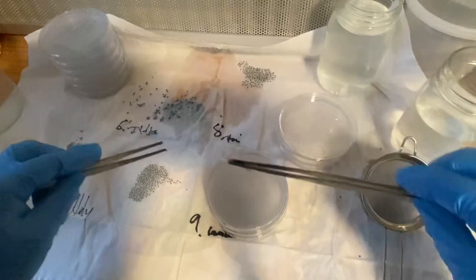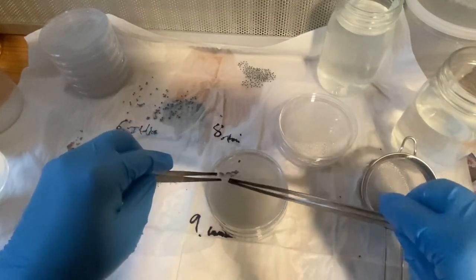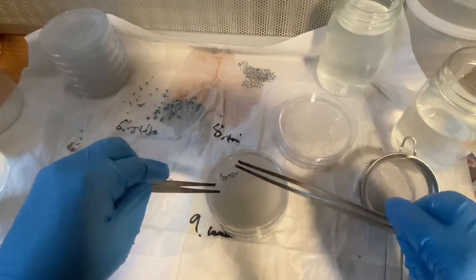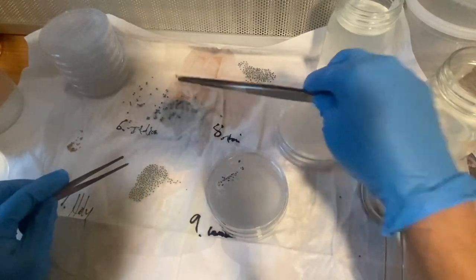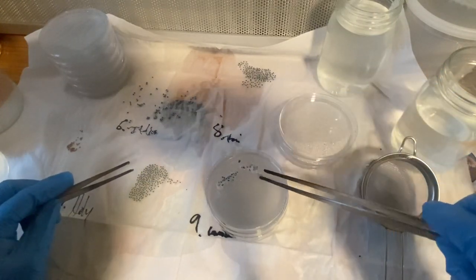Drape is actually sterile, so you can sterilize tissue or paper towels and have them ready so that you can dry your seedlings, and also you can use it as a coating. This is actually a sterile drape you can buy on Amazon.